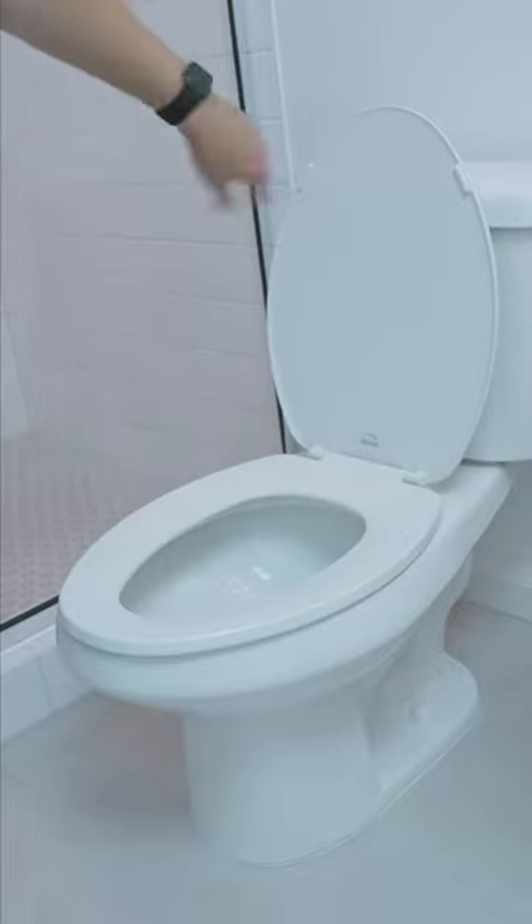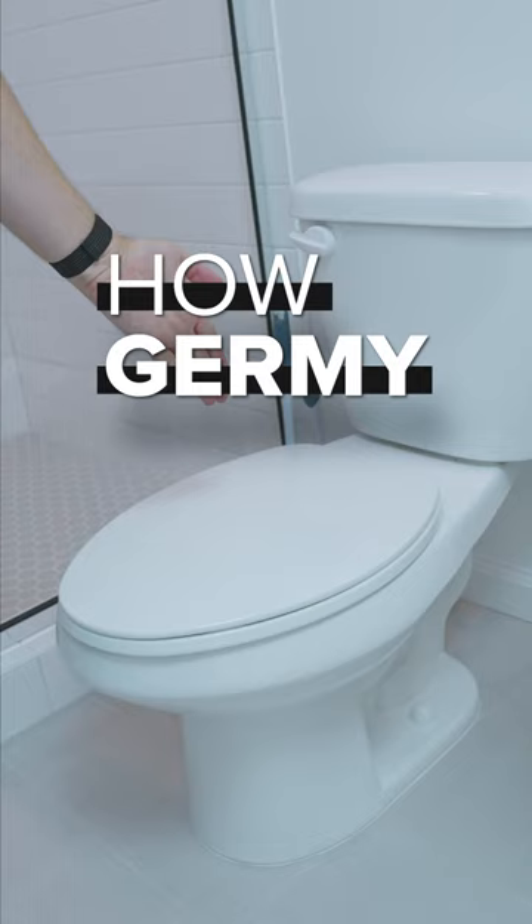So when you flush the toilet, do you have the lid open or do you have the lid closed? Today we're going to find out how germy each option is.